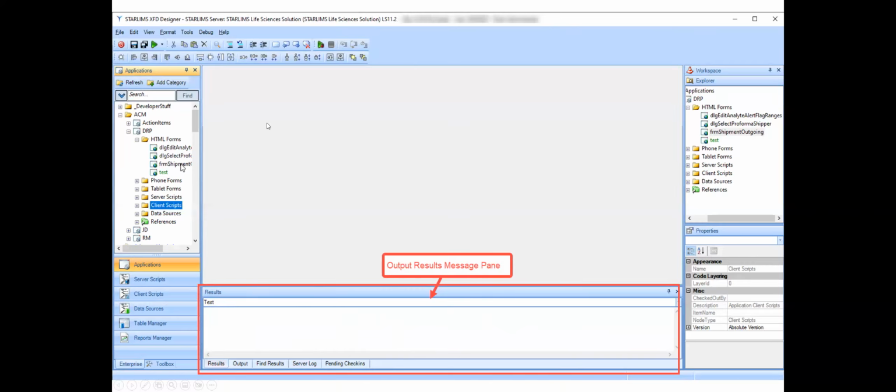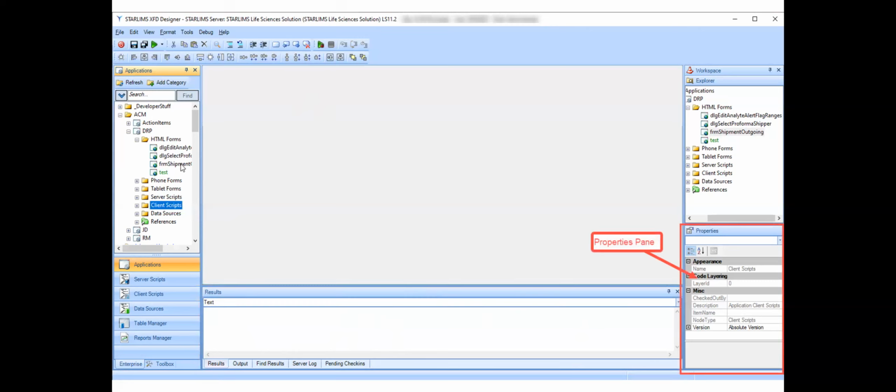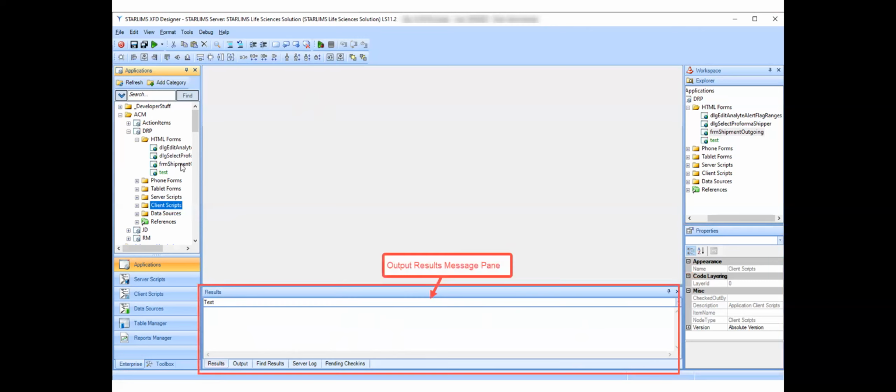If I want to do, for example, a search in all of my code or in the entire system, looking for specific code or instances of code, you will be doing that when you're coding in an environment, let's say for a customer, and you're trying to debug a problem, and there may be an instance of code that appears and you don't know quite what it's supposed to be doing or how the functionality has been set up to work.